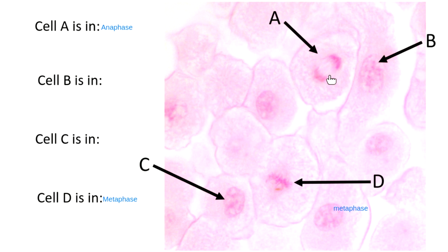So help me out. Let's type it over here. If there was more than one phase that we thought these cells could be, can you guys type for me what we were thinking B and C were? What were some of the options that we thought for B and C? Or maybe the comment was just that they were similar. If we thought they were similar, I did have that note for your groups that it could be the same phase. Yeah, and it seems like our groups kind of agreed.